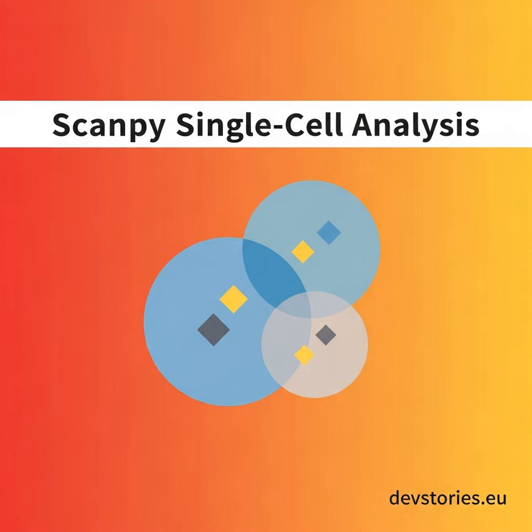UMAP is fantastic for separating distinct cell types, but it can violently tear apart continuous biological processes. When you are studying cellular development, you do not want disjointed islands of cells. You need to see the smooth continuum of state changes. Exploring manifolds with diffusion maps resolves this exact problem. In Scanpy, you calculate this using the tool diffmap.